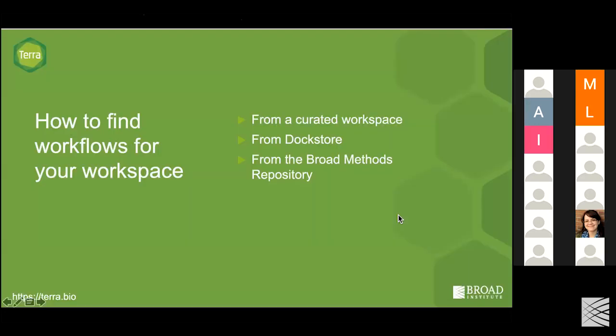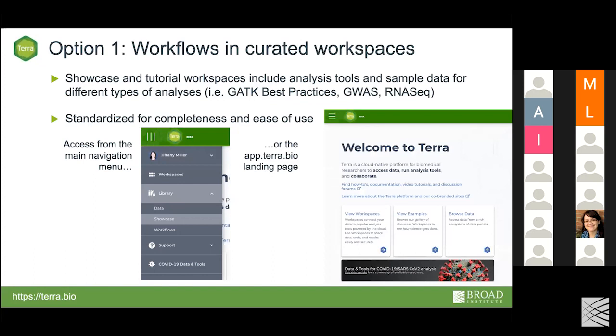Okay. So I'll briefly go over these how to find. This should look familiar, and then we're going to do some troubleshooting guides. So finding workspaces, we already talked about the showcase section in Terra. You can find workflows in the showcase library in curated workspaces.